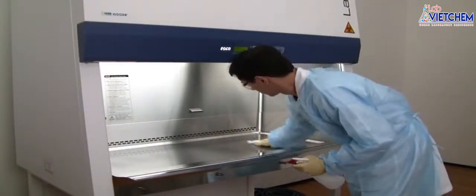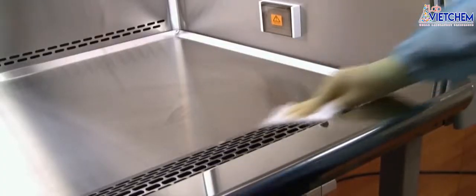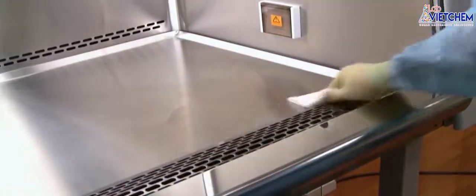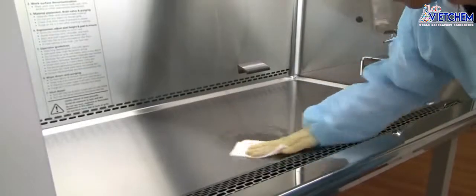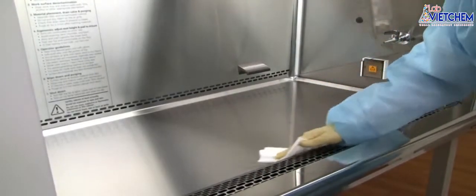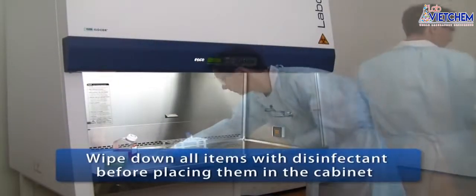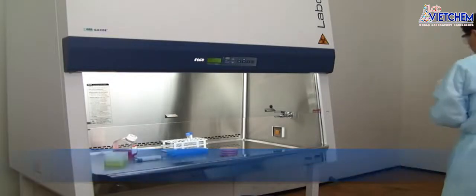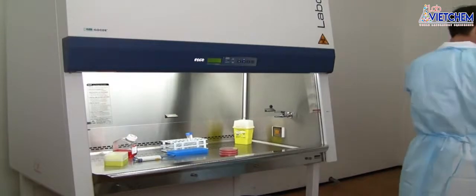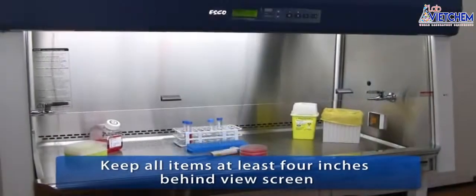Wipe down the interior work zone surfaces, including the front air grill, with a suitable disinfectant, such as 70% isopropyl alcohol. The most effective disinfectant will depend on the organisms manipulated and the work conducted in the biosafety cabinet. Wipe down the external surface of items with disinfectant, then load the cabinet work zone with all the items you'll need for your work. Check the list you've made earlier on. Make sure you have everything you need before you start.